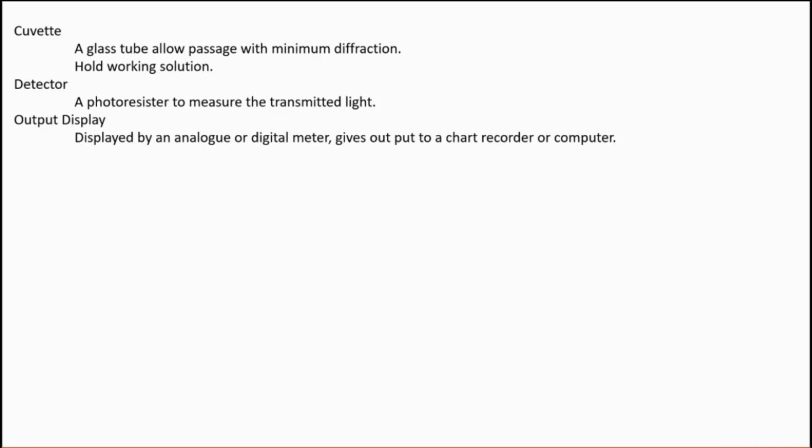We usually prepare and calculate the concentration of so many standards. Standards means its values are ranging between 0 and 100. So many standards are prepared before going to detect the concentration of the unknown sample. So already we have a set of known values, and after having that set of known values, we are going to find the concentration of the unknown.